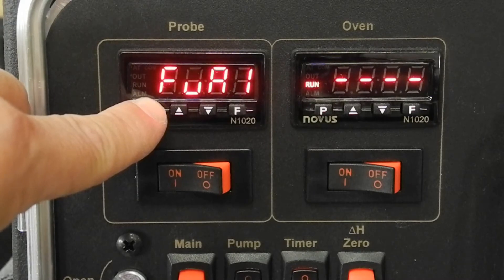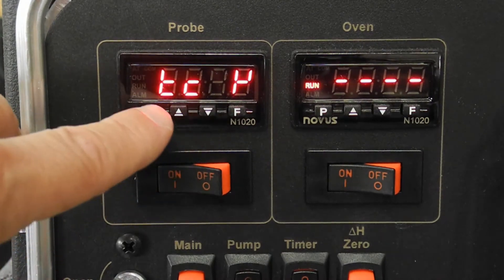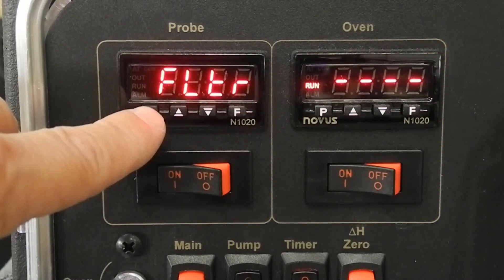Hold down the P key until Type is displayed. Tap the incremental key to choose thermocouple type K, which is represented by a mirror image 4.